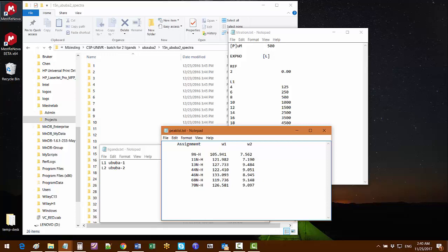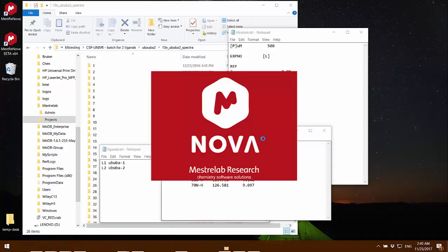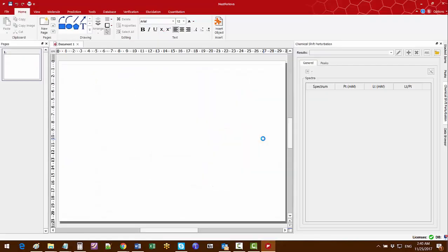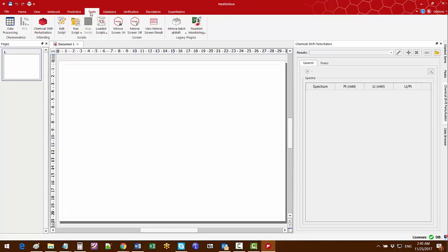Now I'm going to start Mnova and use Mnova Binding to do the batch processing based on those four text files. First of all I go to the tools ribbon and start Mnova Binding from here.